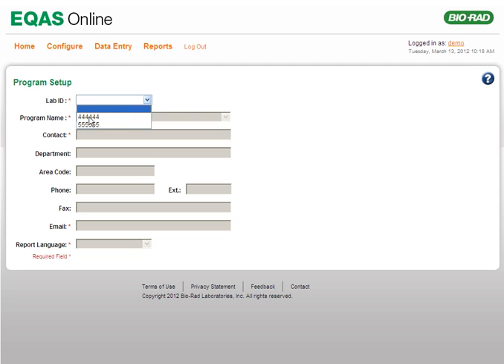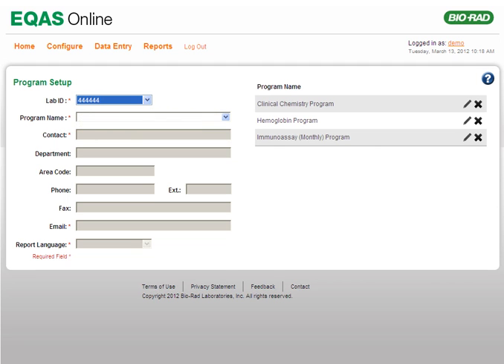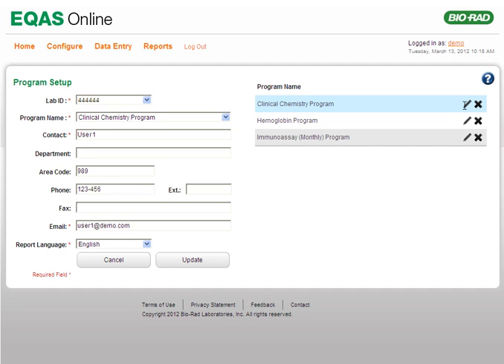Select the appropriate lab number from the Lab ID list. The Program Setup page now displays a list of programs the lab is enrolled for. Click the Edit icon corresponding to the program you want to edit. Alternatively, select the Program Name from the Program Name list. The details of the program are populated on the page. Edit the details as required and click the Update button.